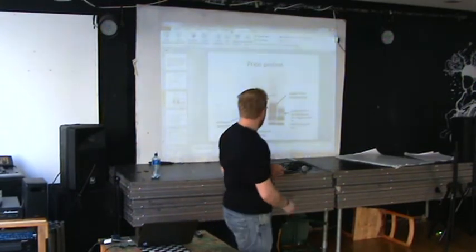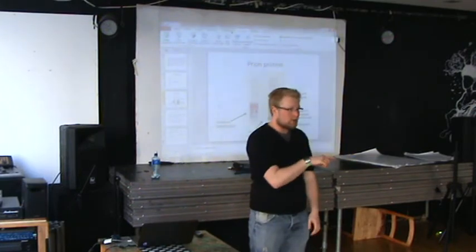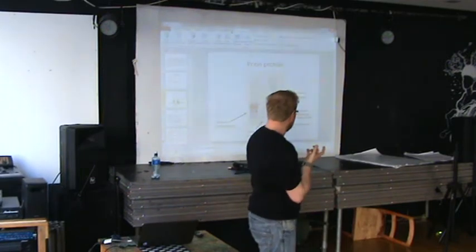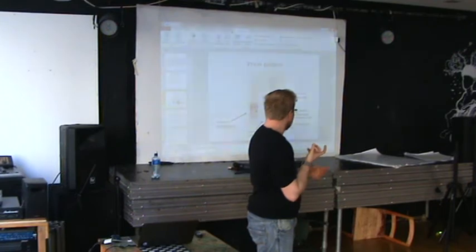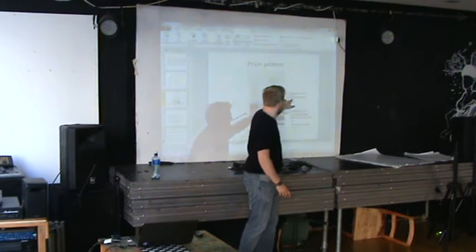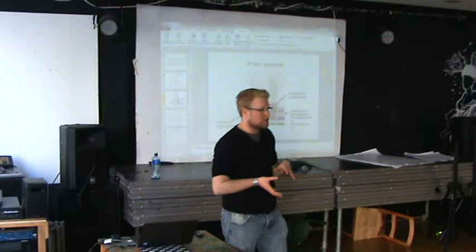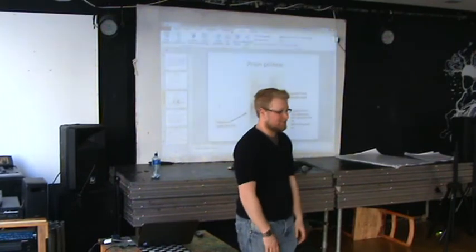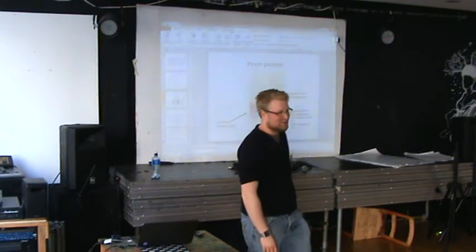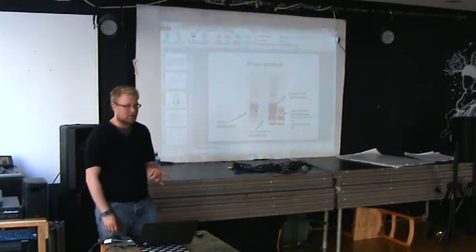And what you'll do is you'll actually get data from this by literally drawing a box, in a program, around the area that's being highlighted, that's in black. And you show that this area is about 50% as strong as this area, therefore there's 50% more protein there. So that's what you eventually show as a graph that will say 50%, which is really depressing. And then you show them the picture and say, see, it's 50%. And that's genuinely what you would do. So that's the sort of example of what you would do.